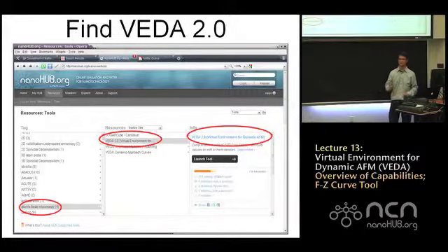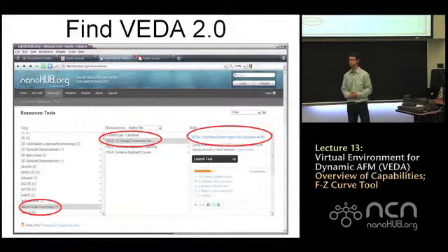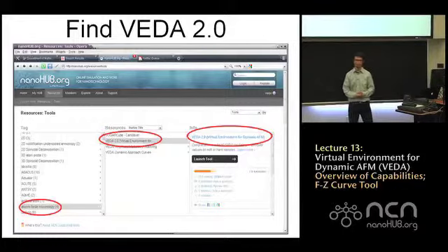so some indication you guys are on the right track. Is everybody on, anybody not on the VEDA website? Okay, great. Okay, and let's first select, so don't launch the tool yet, but let's select the link at the top. And that will take us to a web page for VEDA.